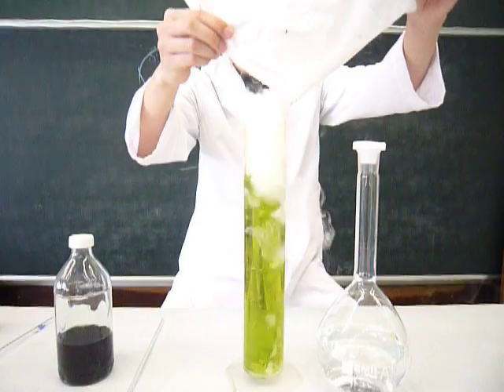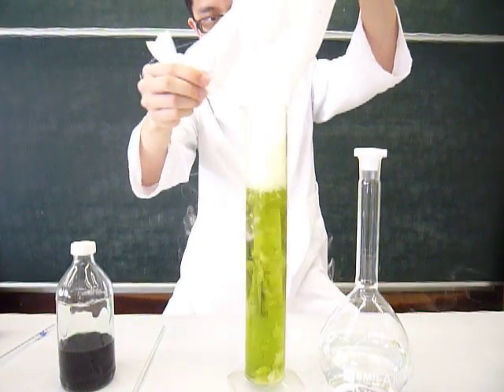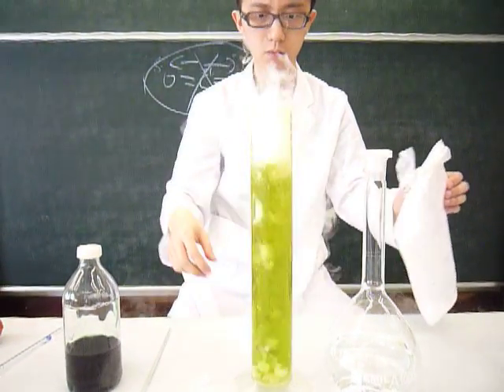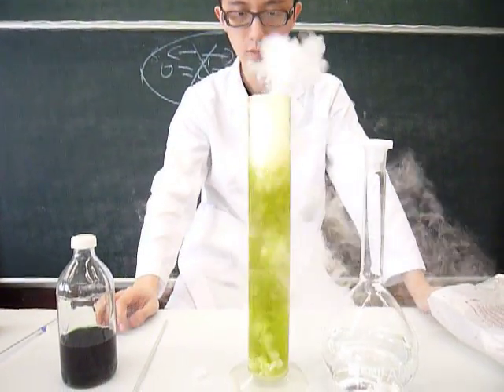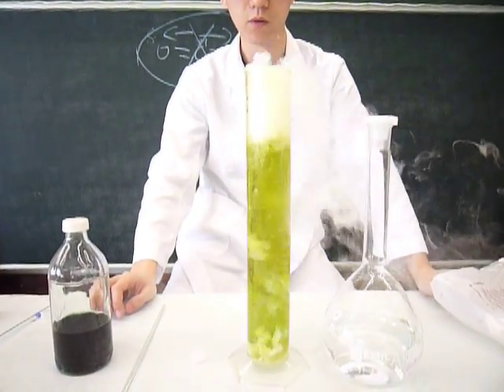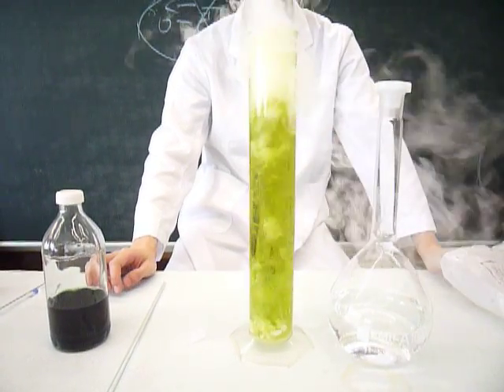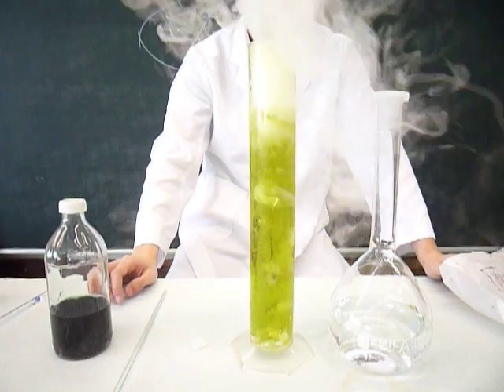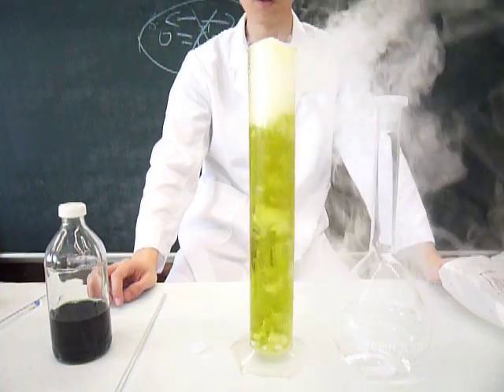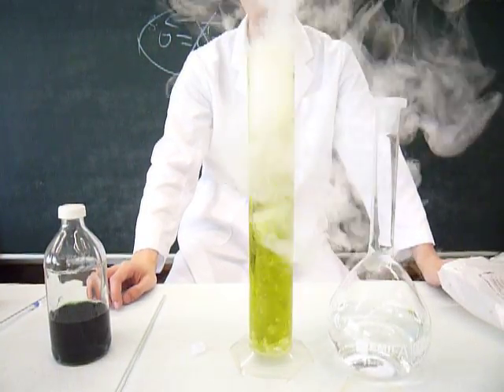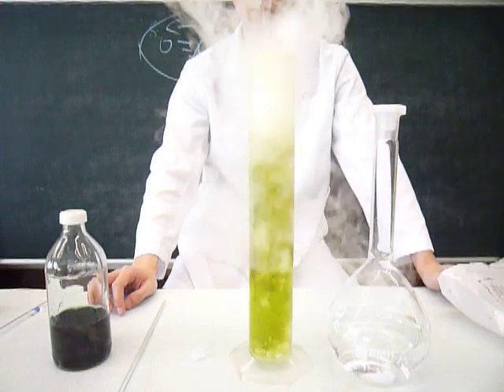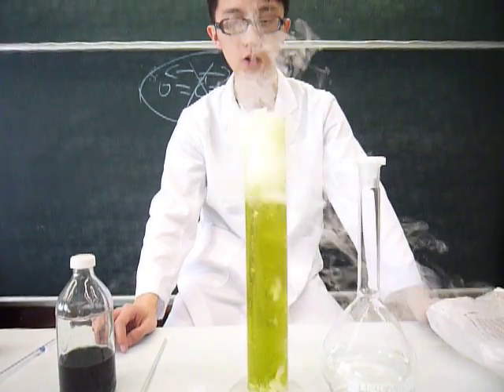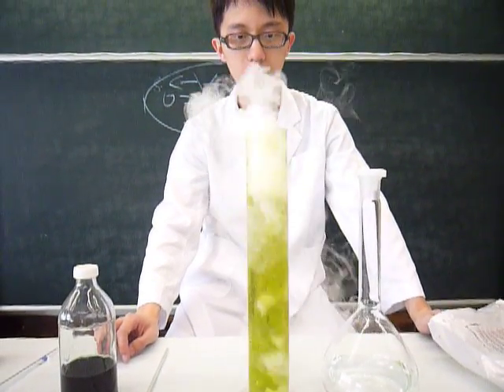You can try to put more dry ice into it and let's see what happens. Now the solution becomes green in color and will not change to red, because carbonic acid H2CO3 is only a weak acid, which gives a pH of about 5.7.